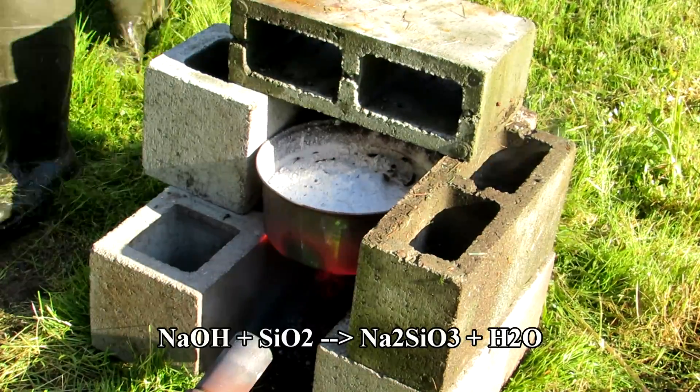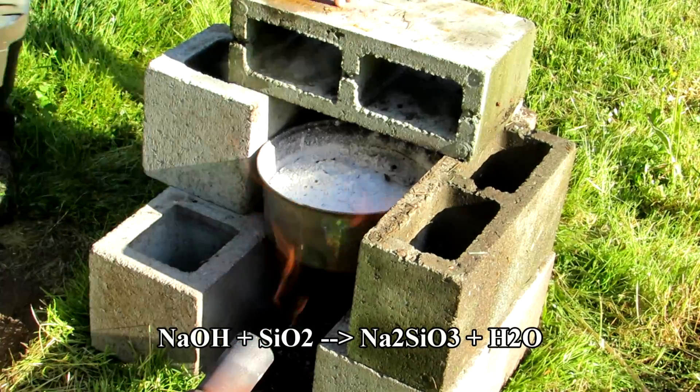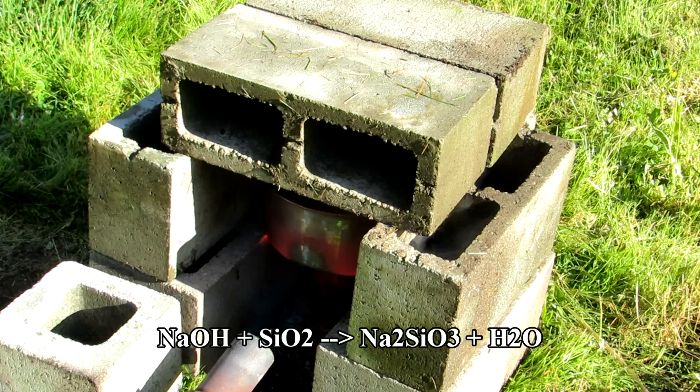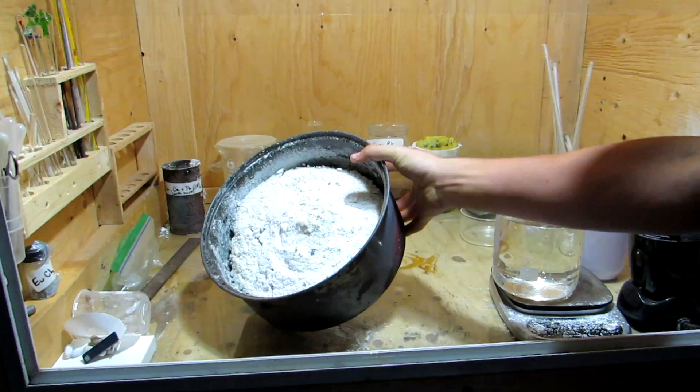To allow everything to reach a red hot temperature, it was insulated with some bricks. As the sodium hydroxide melts, it reacts with the silicon dioxide to produce sodium silicate and water. Once no more water has evolved from the reaction mixture, it can be left to cool.